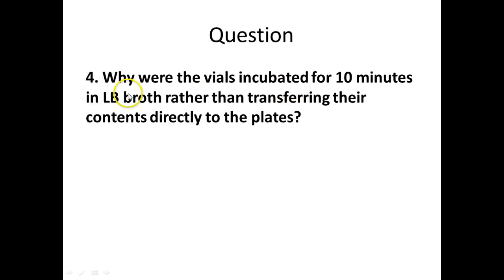So why were the vials incubated for 10 minutes? We're going to add that food and we're going to leave them for 10 minutes on our lab bench. What are they going to be doing in those 10 minutes? They're going to be eating. We gave them DNA too, right? What do they do with DNA? They're going to use it. They're going to make messenger RNA and they're going to make proteins.